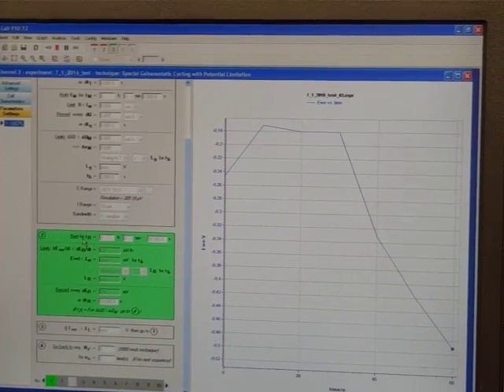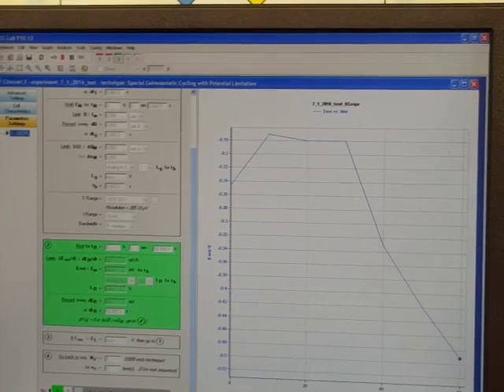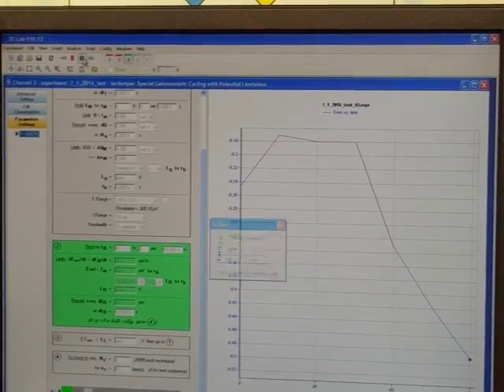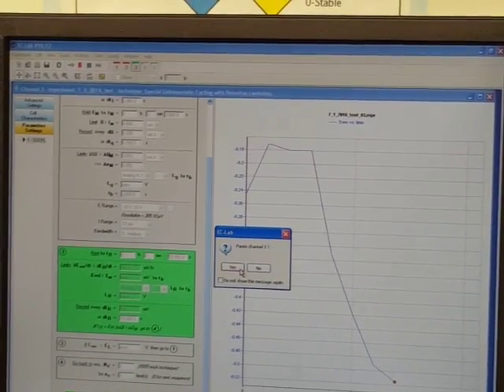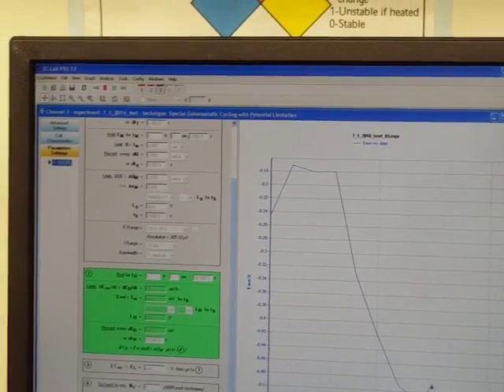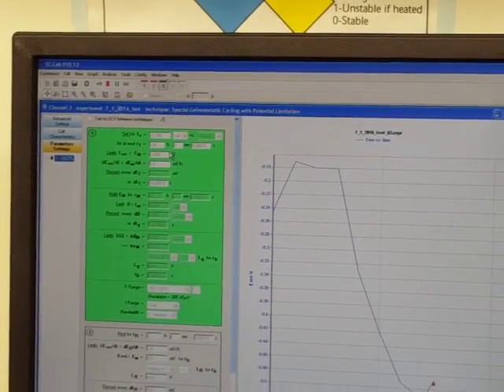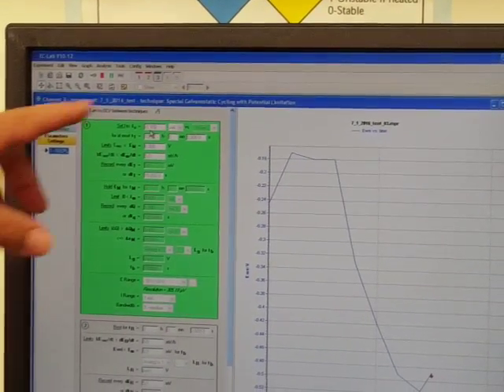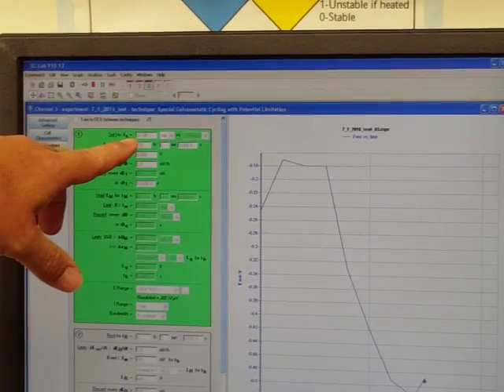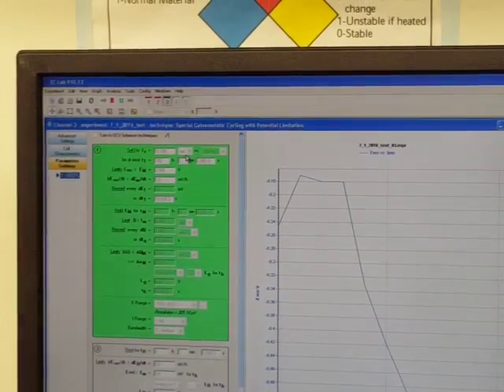And this sequence here says it's going to rest for 1 minute, and then after 1 minute, it's going to switch to the next. I'm going to push pause because I don't want it to just run through these things. Sequence 1 says here, set I current to minus 0.1 milliamps, right?